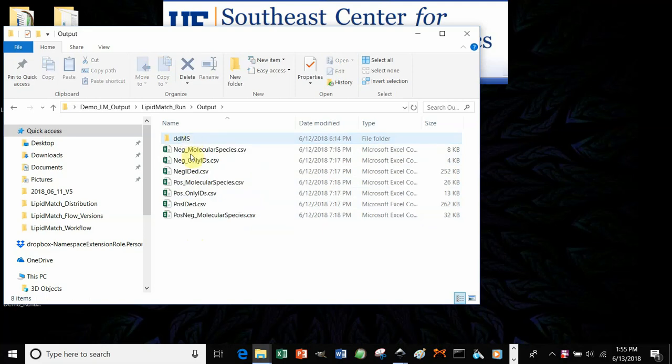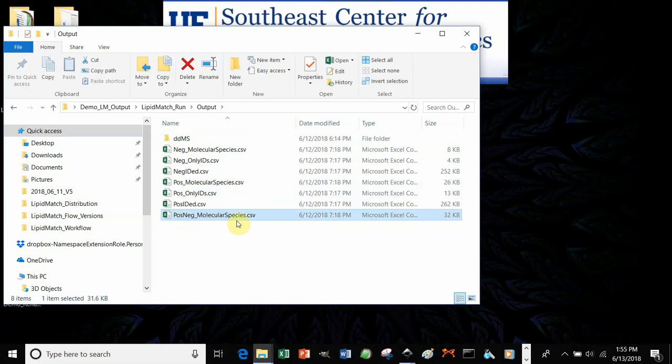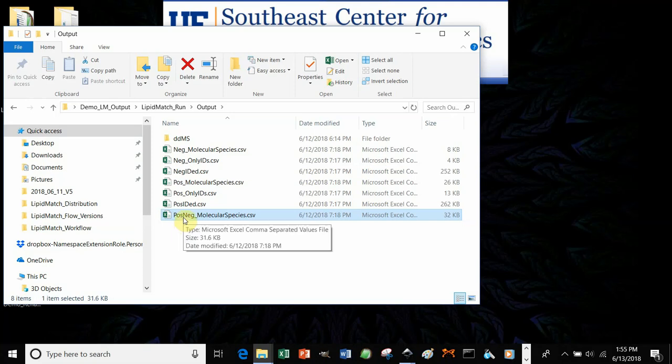The file that you'll be most interested in is posneg underscore molecular species. This is the list of all your lipids identified in their peak areas, combining positive and negative polarity data.